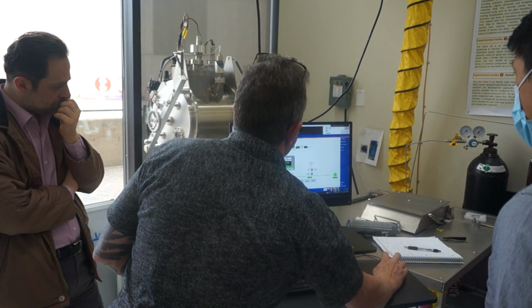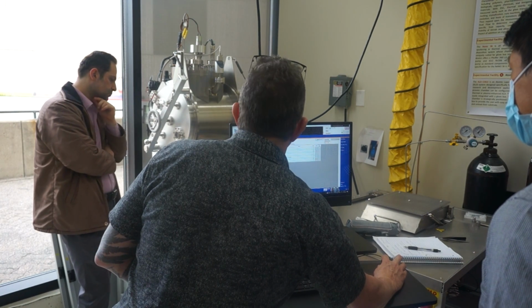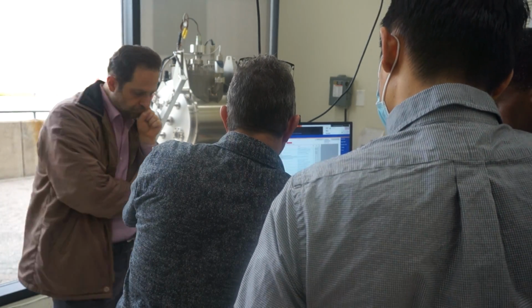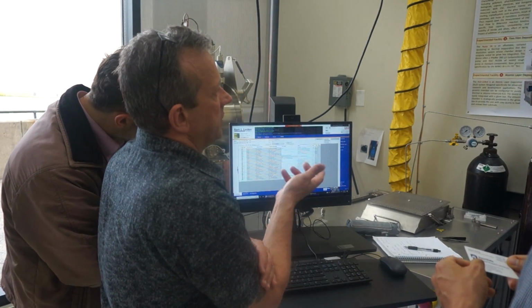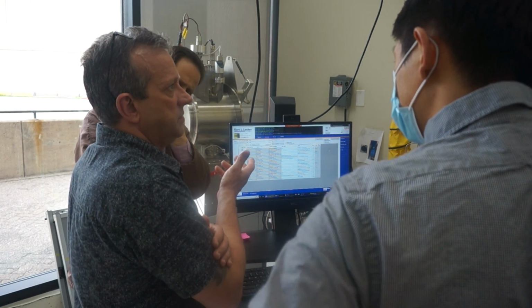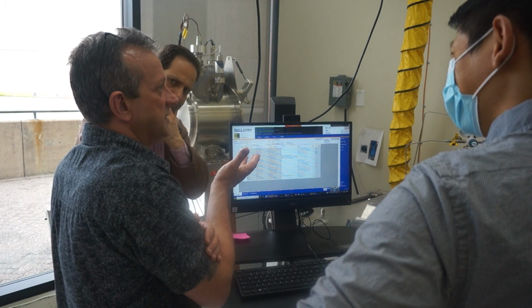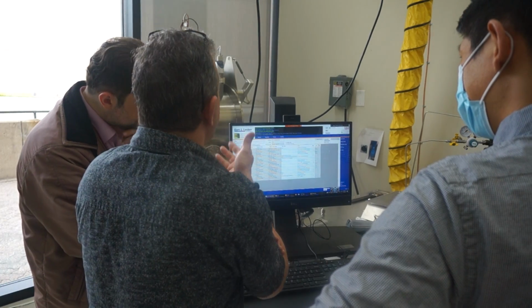So, in the recipe, this is the only process recipe you have for the aluminum oxide. And I have some information I'll give you here in a little bit. But a lot of this stuff you can go on YouTube. If you search YouTube for aluminum oxide ALD, there's a nice little PowerPoint demonstration that lasts about 3 minutes, and then there's no gray area. It's like, I get it. And also with some other materials.